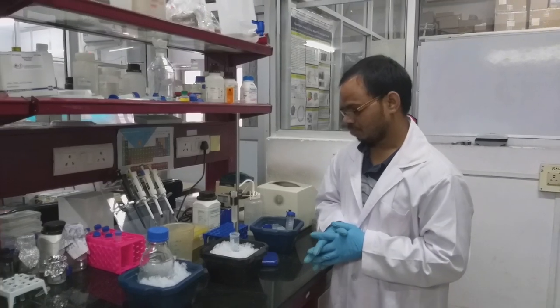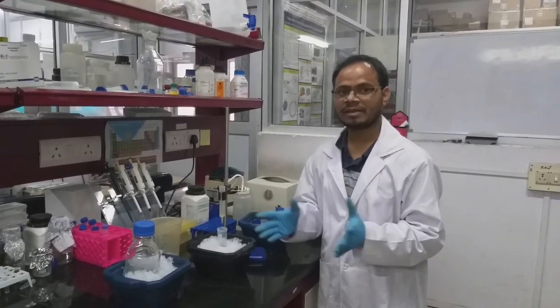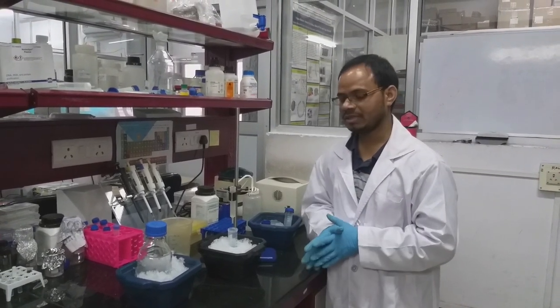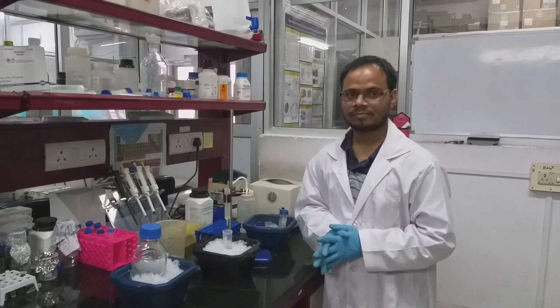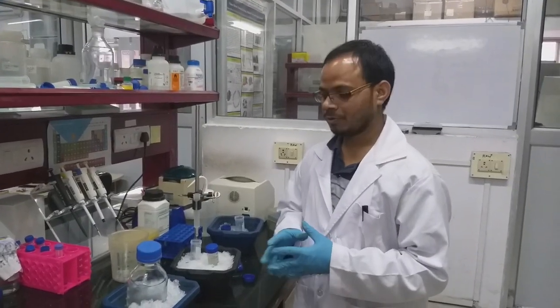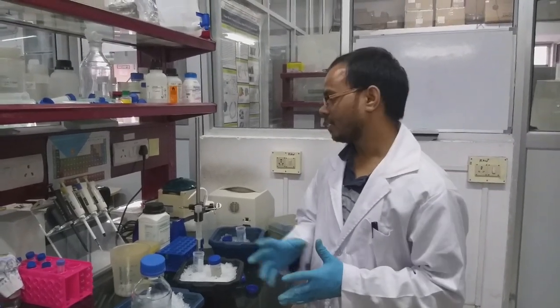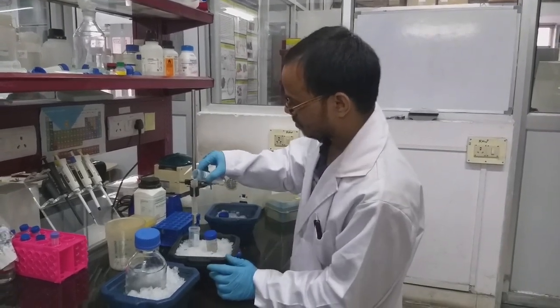So this is the flow through. Whatever we are getting is flow through. Next step, we will wash with the lysis buffer. In this step, we are going to wash with the lysis buffer or equilibration buffer. So, this is the lysis buffer.